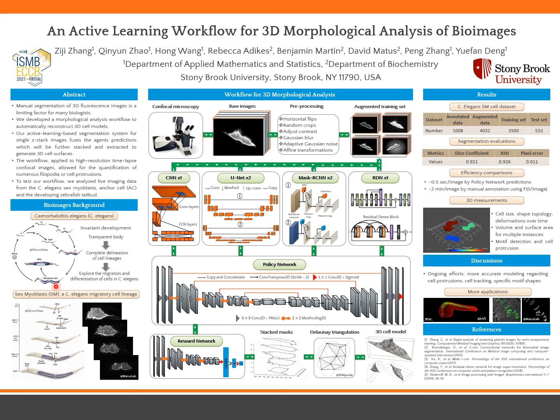These cells generate numerous actin-rich filopodia and exhibit complex cytoskeletal dynamics throughout their lifetime. And the accurate analysis of these biological phenomena with statistical robustness requires the interpretation of 3D images. Not only are the inspection and quantification of such images exceedingly laborious, but they are also extremely difficult for reconstructing 3D cells from meaningful 2D perspectives by manual annotation of subcellular geometries.